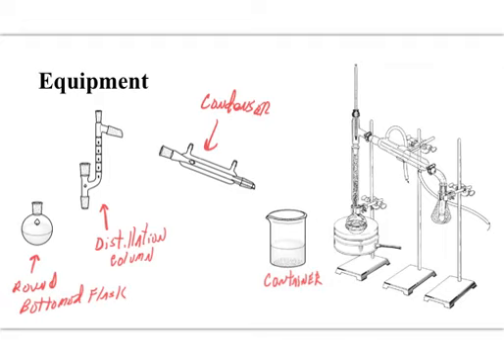I'm not sure what kind of a container we're going to have. It might be another round bottom flask. We may be able to use just a vial for this. Right? So the entire setup should look something like this.